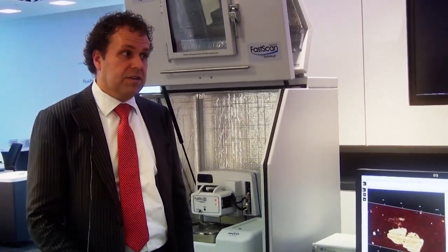Bruker in Karlsruhe is one of our three demonstration labs in Europe. There is one also in Paris, one in Coventry, but really the office in Karlsruhe is the biggest of the three and it serves not only the customers in Germany but also in Eastern Europe and Russia.